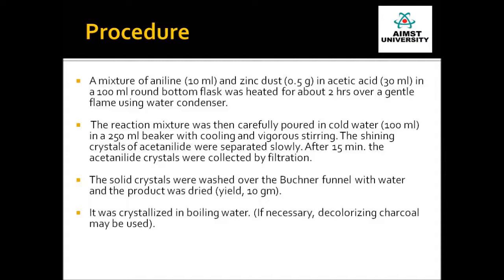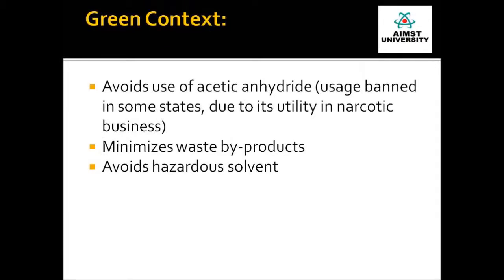The solid crystals were washed over a Buchner funnel with water and the product was dried. The product is then recrystallized using boiling water, kept for drying, and then determined for melting point and percentage yield. Here we end the procedure of green synthesis.